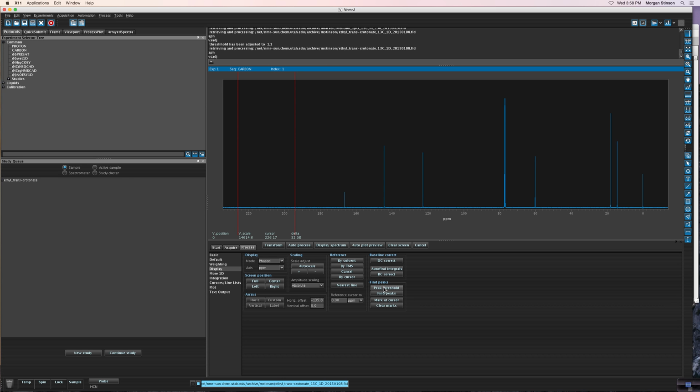Then select Peak Threshold under the heading Find Peaks. This will display the threshold in the interface. All resonances above the threshold line will be considered, while those below will not. This allows you to select what resonances you would like to determine the chemical shifts for.